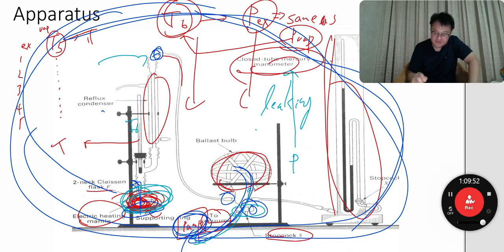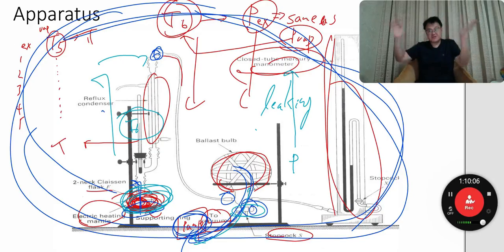The system's pressure is automatically increasing due to the leak that you should have in your system, and the temperature increases. That means the system can be regarded as being in equilibrium at any point: the pressure is gradually increasing due to the leaking of the system, and temperature also increases continuously, right? So after evacuating, you heat, so your liquid boils, and during boiling the pressure increases slowly and temperature increases slowly.